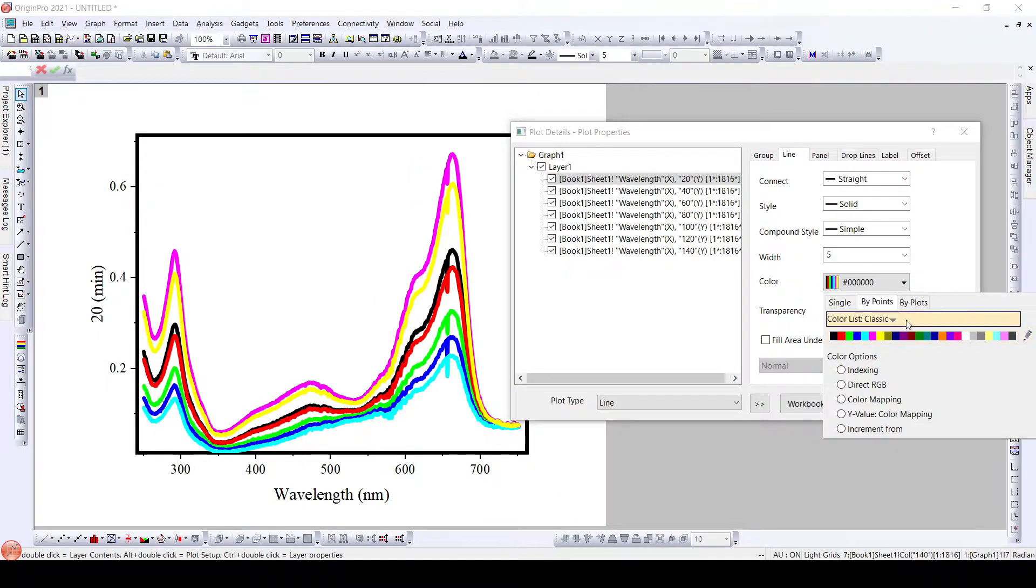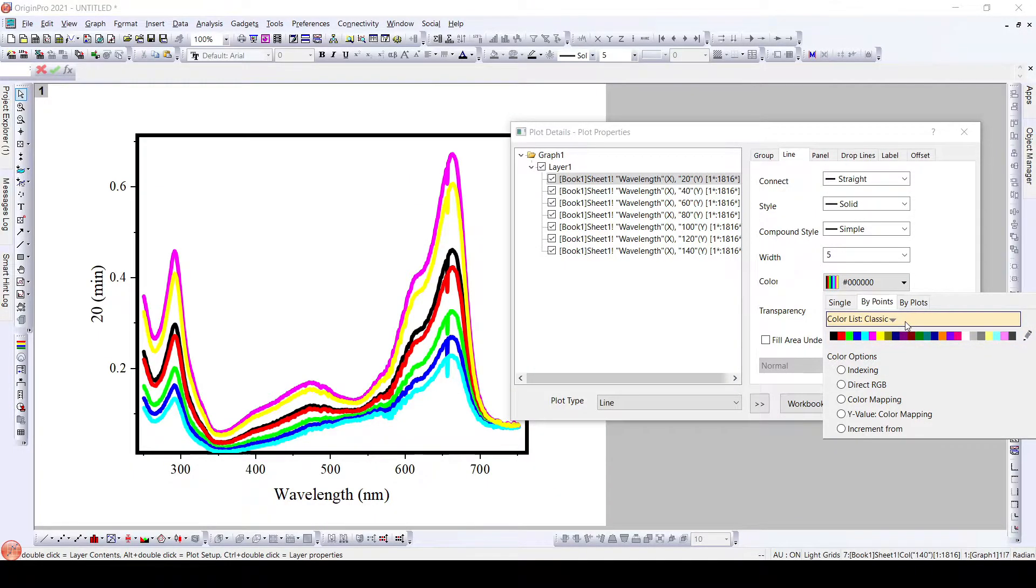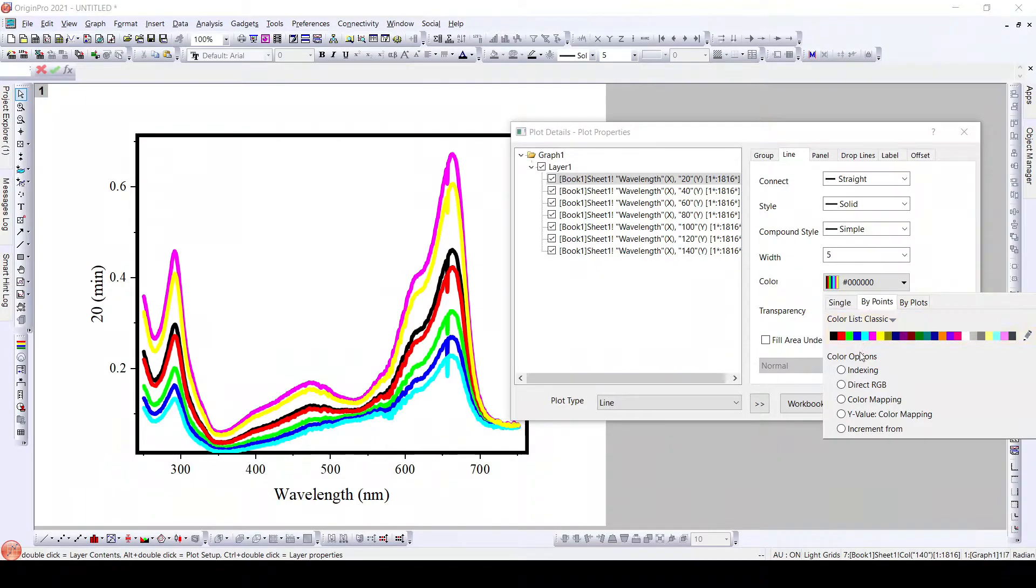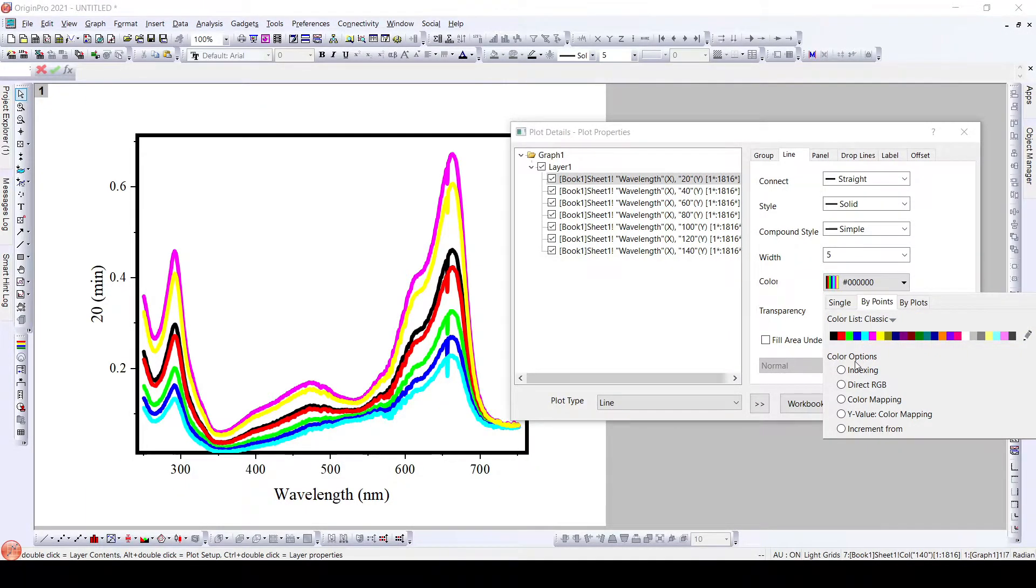Using this particular color schemes, we can color them. It is already colored single single point, but now here what we have is we have different color options.